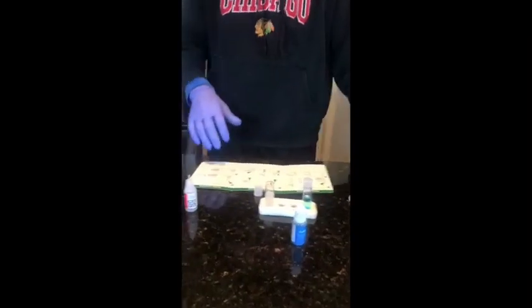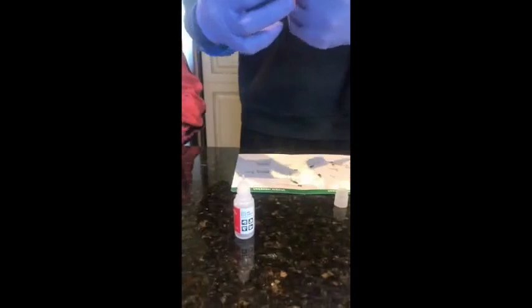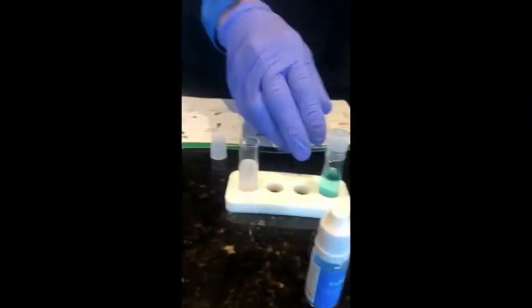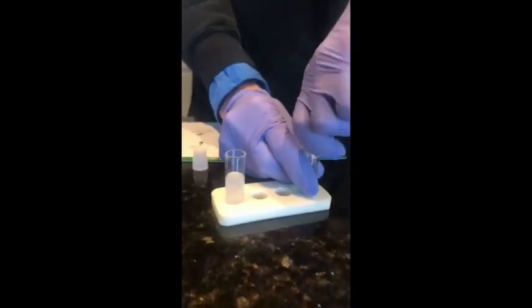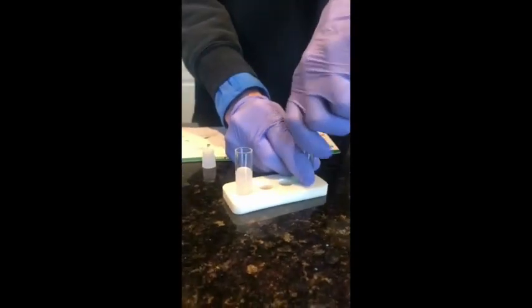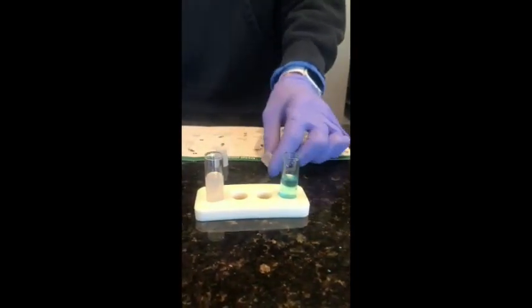Next thing we're going to do, so the two solutions are ready. Duncan's got his pieces of zinc wire out of the material, and we're going to put them in, one into each vial. And we're going to set the timer for 15 minutes to allow some reactivity to happen here. So we're going to take a small break from you. Duncan's going to put them in.